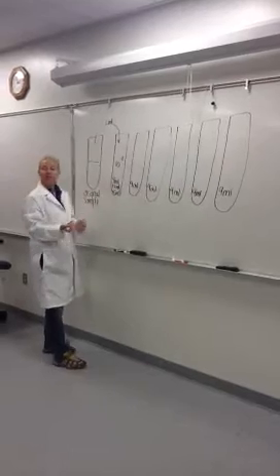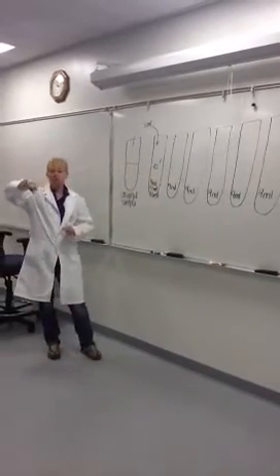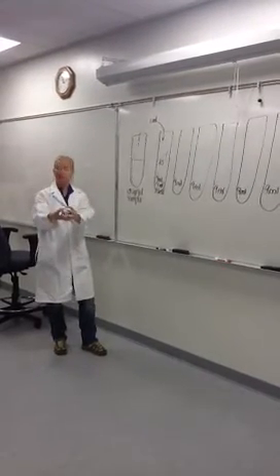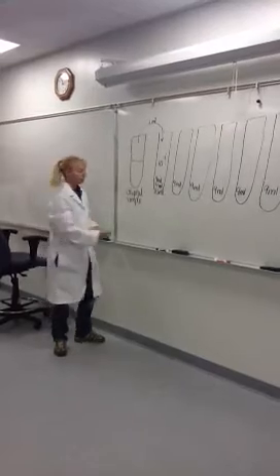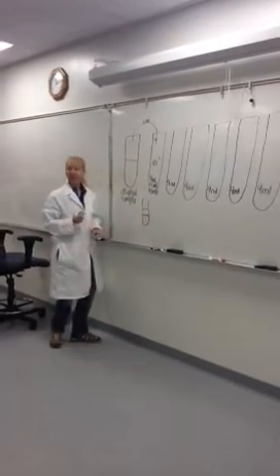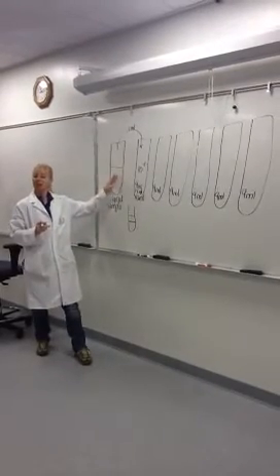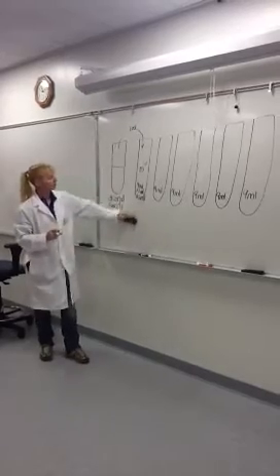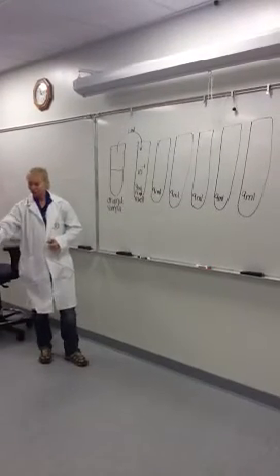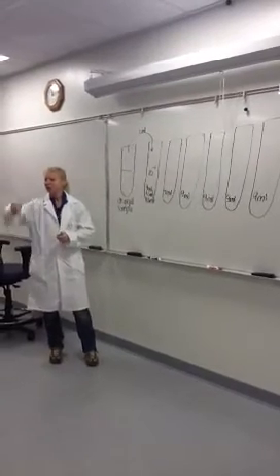So now we have one-tenth dilution here. Still not diluted enough. So we would mix this up. And when you mix it, usually you want to swirl it with your hand like that. You wouldn't want to use a centrifuge because what that does is it clusters them all together down at the bottom. If you centrifuge blood, you'll notice that you get three kind of layers in there because it moves all of the dense stuff to the bottom. What we're trying to do is get a random sample of what's in here. So we want things to be as evenly dispersed in there as we can.